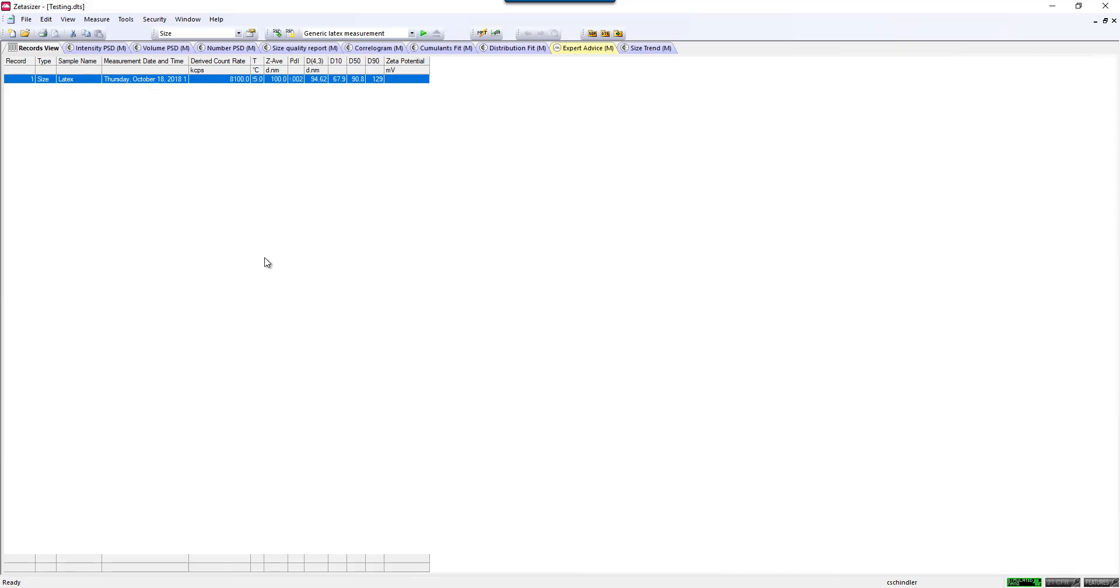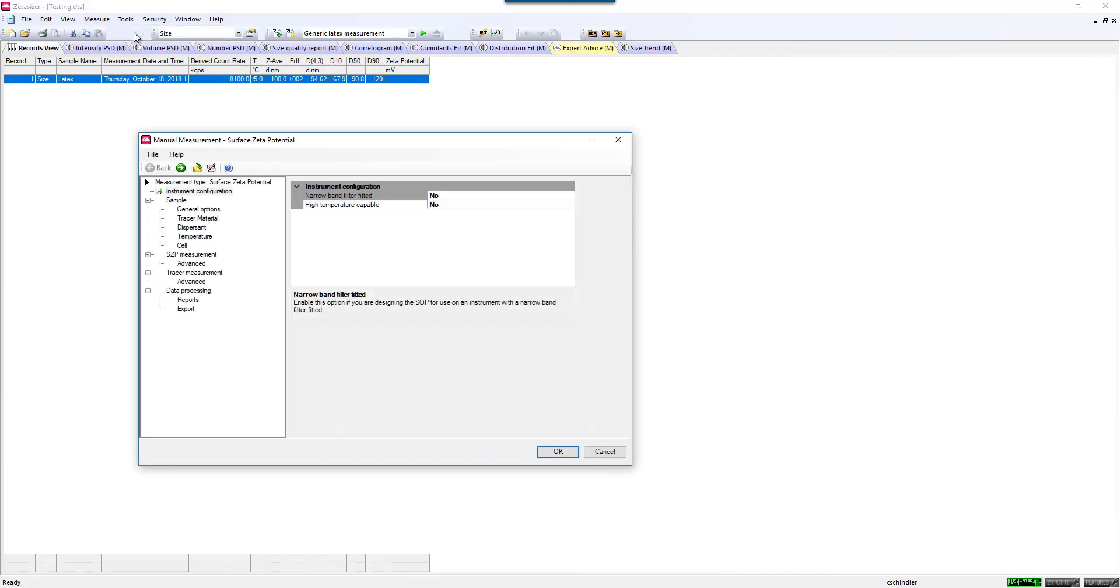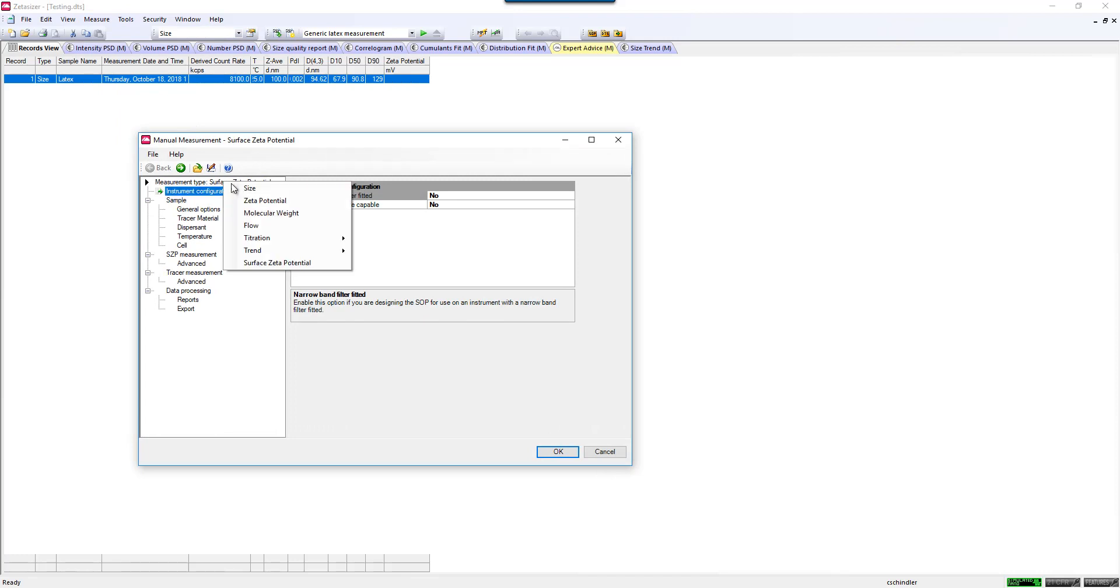If you need to write a new sizing SOP, you can go up to Measure, Manual, and you can write the SOP. So first, we will click Measurement Type and change this to Size. You'll notice there's a variety of different types of measurements that you can make and create, but for this one, we'll talk about sizing.